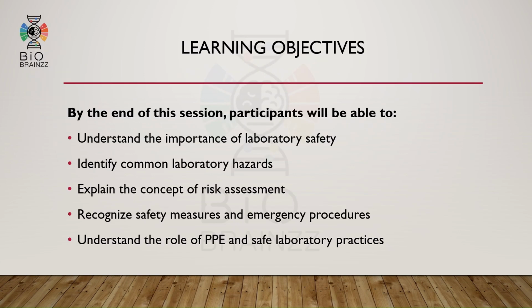By the end of the session, you will understand the importance of laboratory safety, different types of laboratory hazards, the concept of risk assessment, emergency preparedness, and the importance of PPE and safe laboratory practices. These concepts are essential for every student, researcher, and laboratory professional.